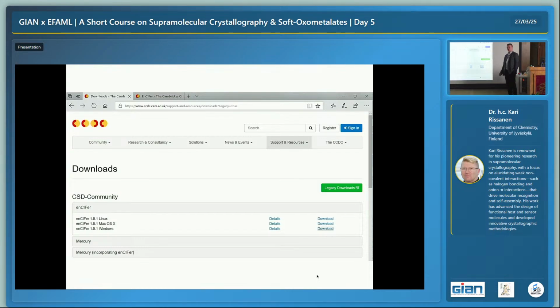So what to do then? Because this is the thing we have. We have finalized everything. And now we want to have the final. We have done the check by ourselves. We have seen there some coordinates and we have seen distances, angles, all these kind of things. It's also shown here in a cartoon, but I will also show you we can program, analyze our structure visually. But this is the printed version.